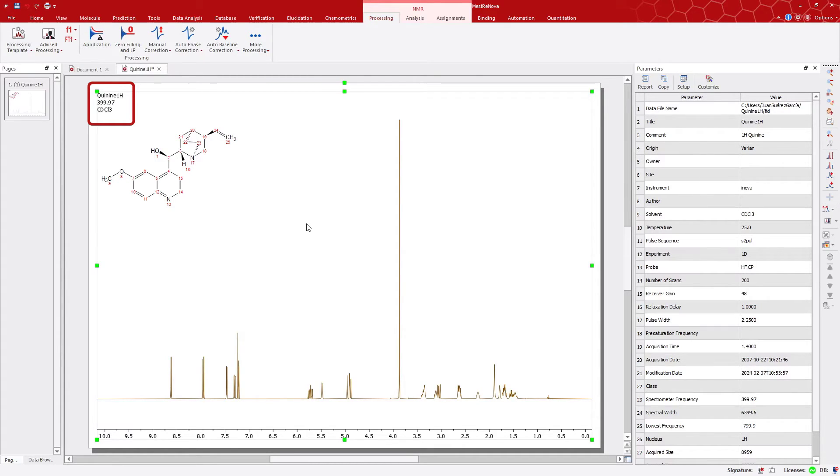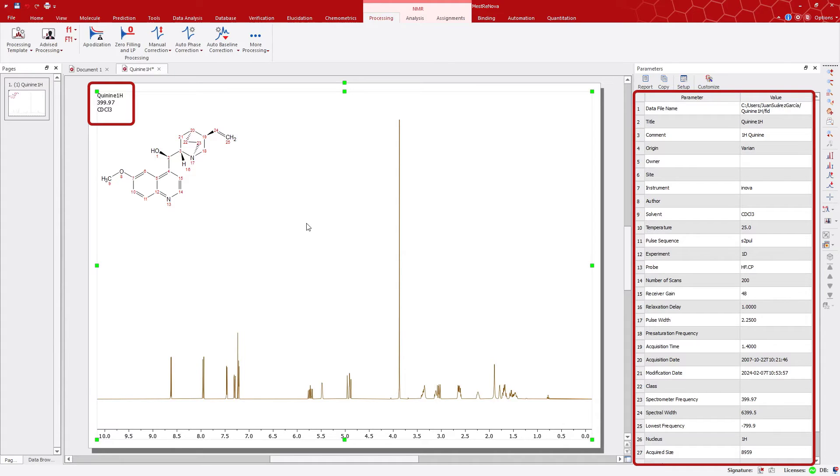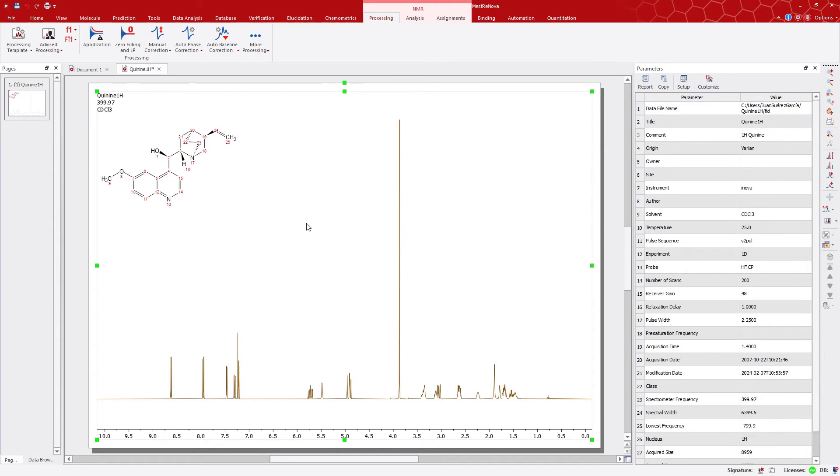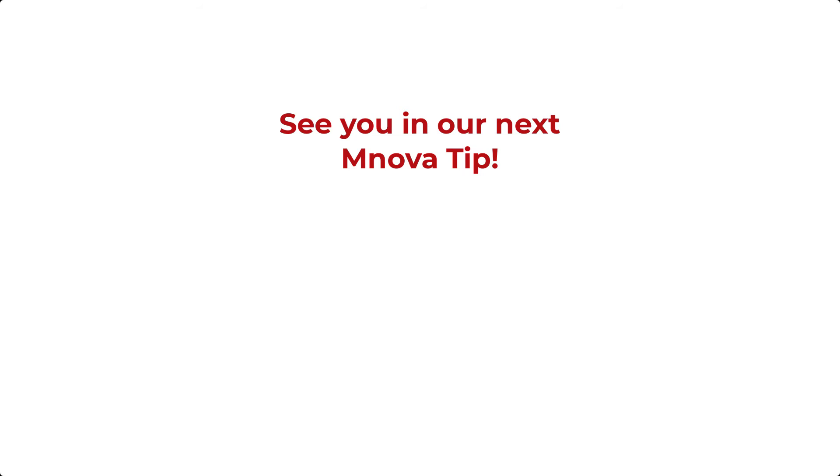Feel free to replicate this for any other parameters you wish to display on your spectrum. Thank you for your attention, and stay tuned for more MNOVA tips.